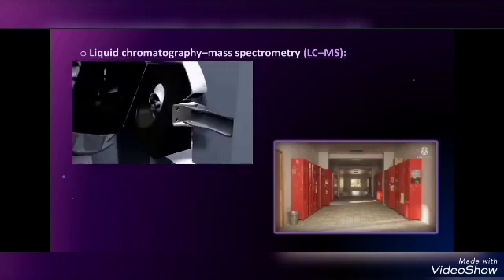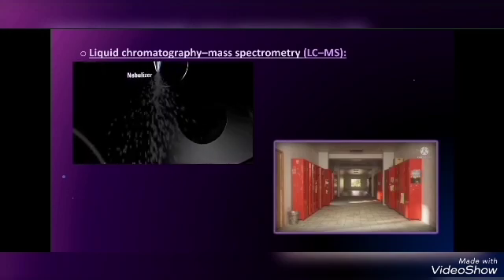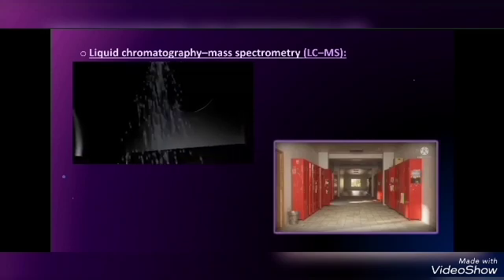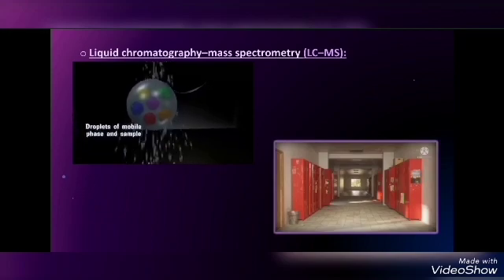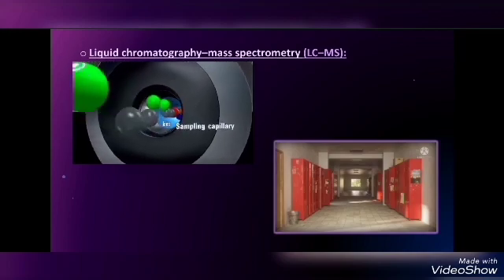Liquid chromatography-mass spectrometry, LC-MS. We start with the nebulizer. Then the droplets of mobile phase and sample turn to ions and go into the sampling capillary.